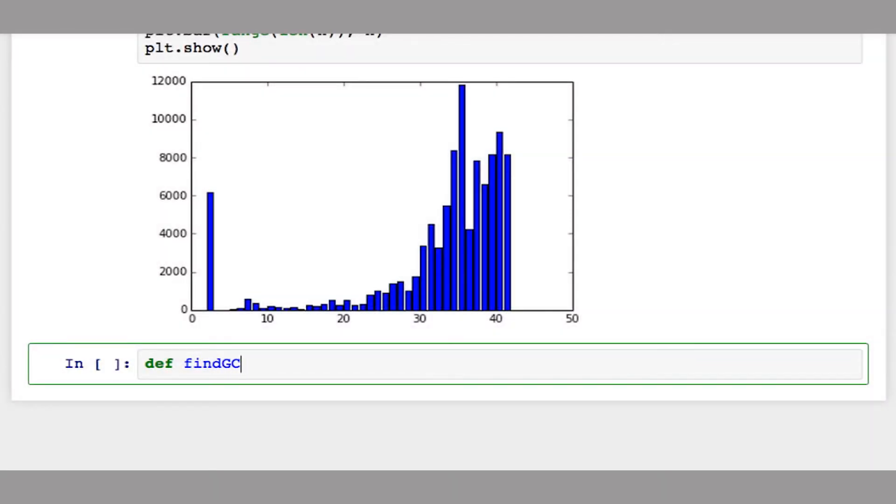Let's create this function. We'll call it findGCByPosition and pass in a set of reads. In this case, we don't care about the quality scores, just the strings of bases.